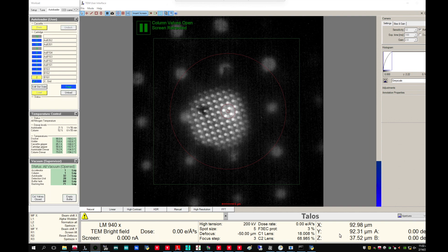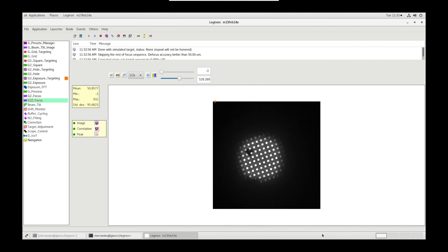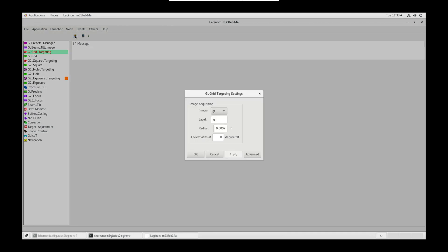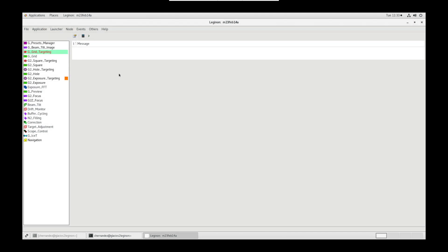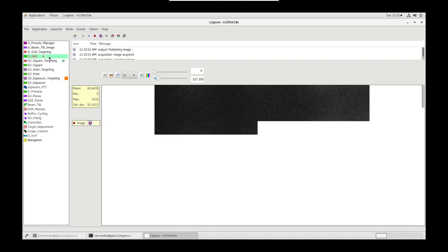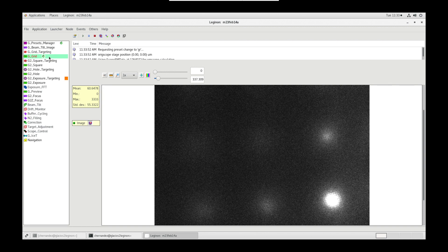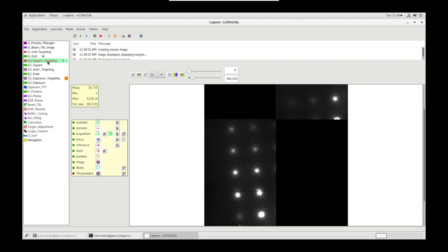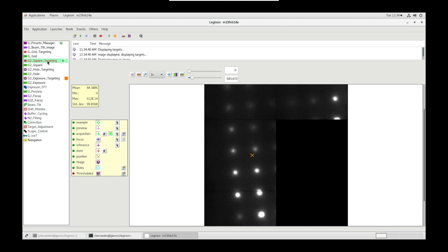Next, let's go into grid targeting node. Since we changed the settings earlier, we don't need to change them again, but you could if you needed to. Then, let's click calculate atlas. And publish atlas. Grid node will take an image at grid magnification while rastering around the grid. In square targeting, we can watch the images stitched together to obtain a complete picture of the grid.